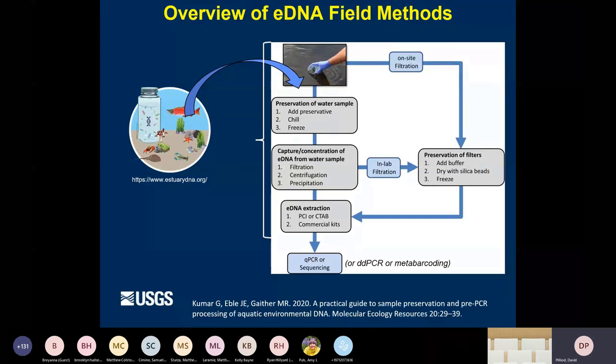Okay, so this is a diagram that comes out of a recent paper by Kumar. It's a pretty cool paper. I'd recommend people look at it if you're interested. It's called A Practical Guide to Sample Preservation and Pre-PCR Processing of Aquatic Environmental DNA. It's a nice synthesis of information.